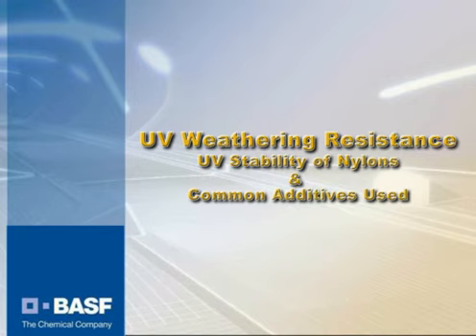As far as the UV weathering section of this, although it's geared toward automotive and some of your lawn and power equipment type operations, the type of testing done and the procedures that are utilized to do that apply to just about any molded polymer, whether it be nylon or in the polyolefin type of polymer.